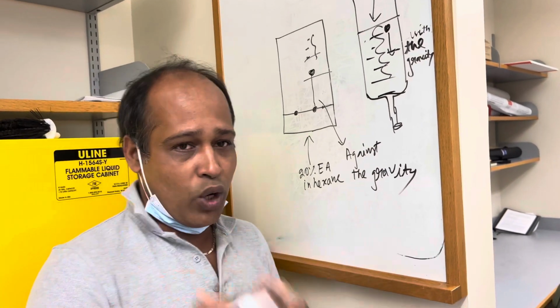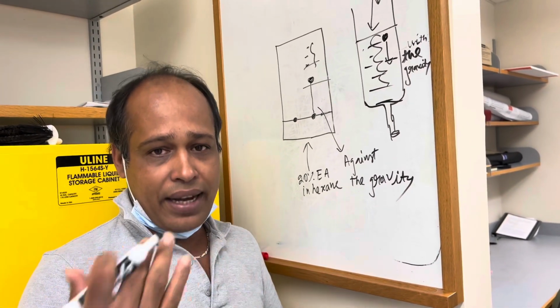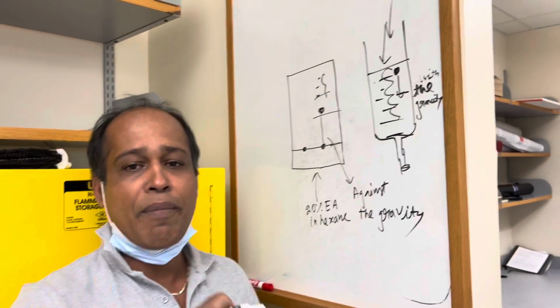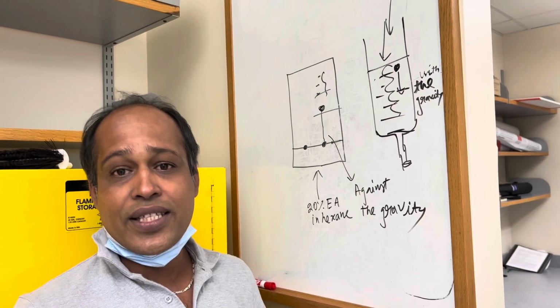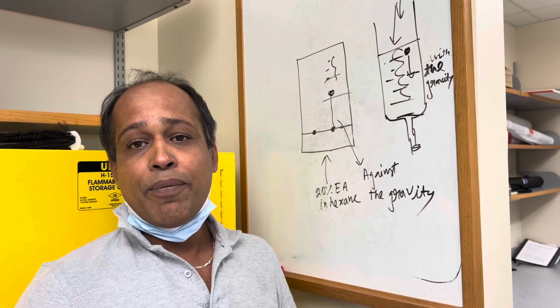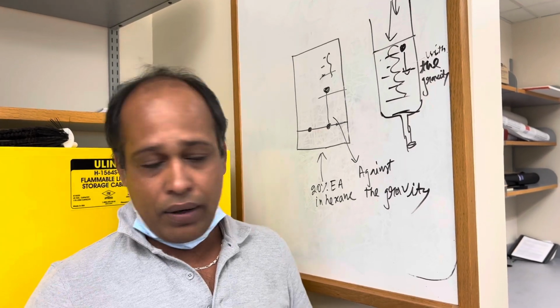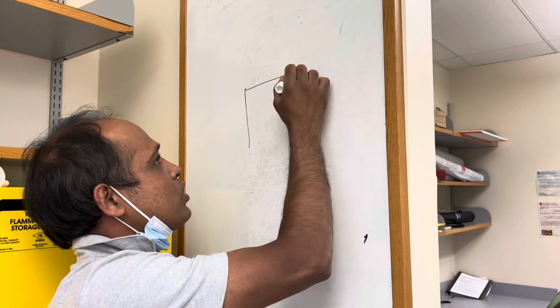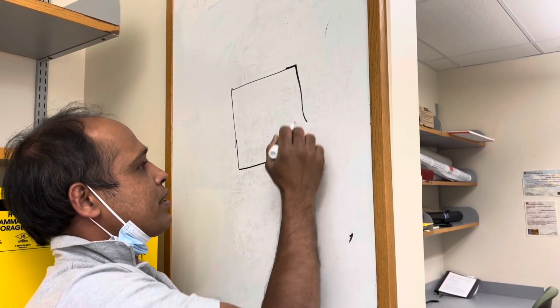Sometimes with the polar silica gel, that secondary NH could be problematic, like dragging or making something else. So in that case, you can do a two-dimensional TLC before putting it on the column. What is two-dimensional TLC? So make kind of a square shape TLC.